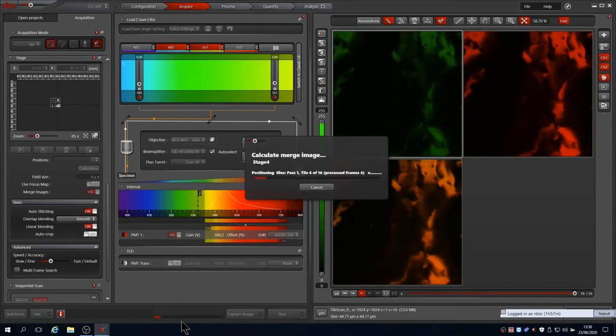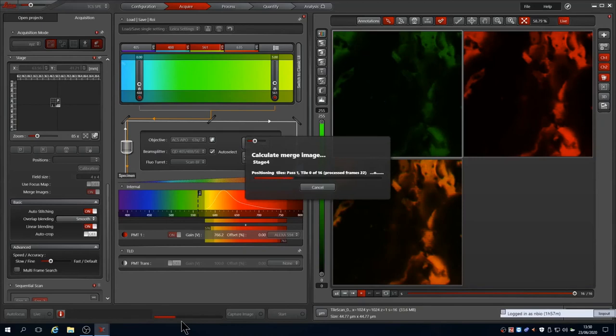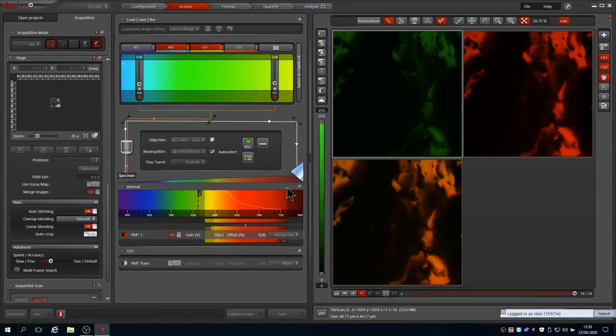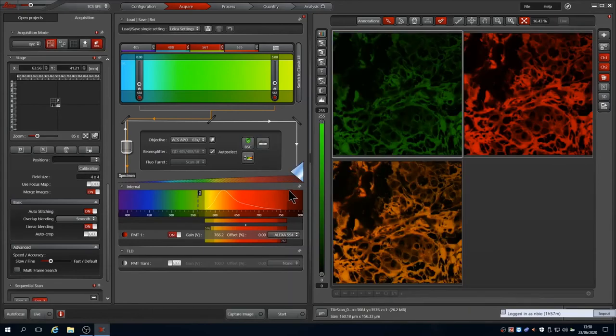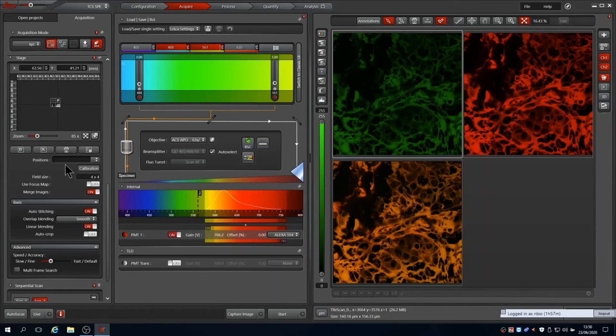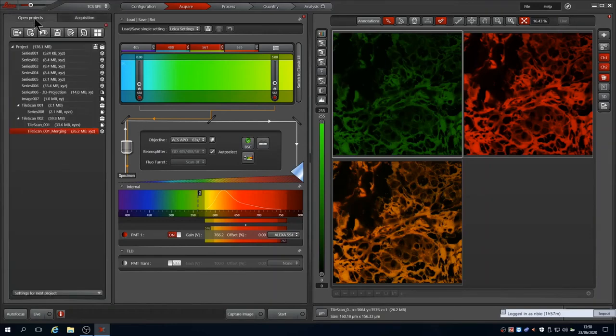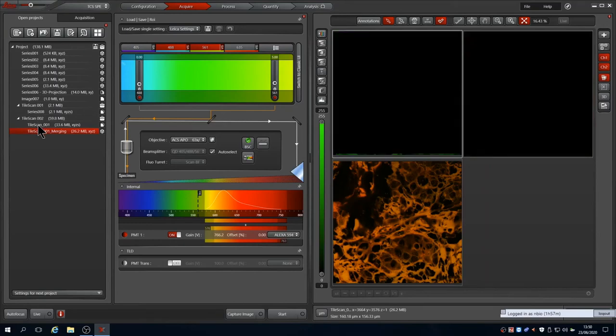After capture, since we have merged images on, it will attempt to stitch them together. Again, this is stored as a new image in the lift project. You'll see that the Tile Scans are stored as subfolders inside the lift.